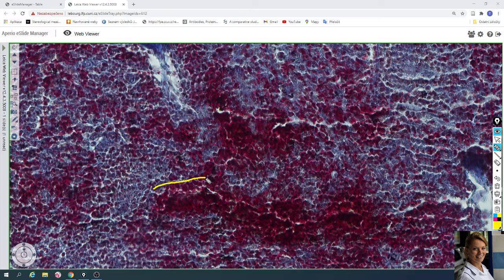For example, here is a venous sinus, a dilated sinus full of erythrocytes, and the bluish splenic cords contain macrophages, lymphocytes, or reticular cells. So this is the venous sinuses, and between the venous sinuses you can find the splenic cords.